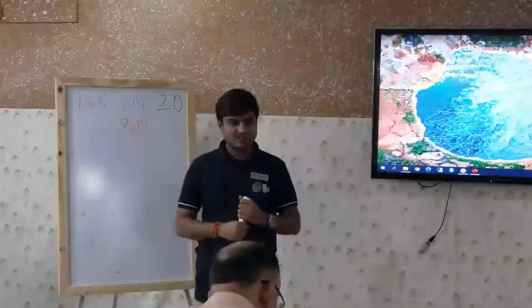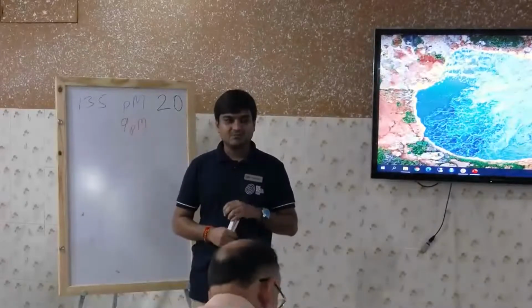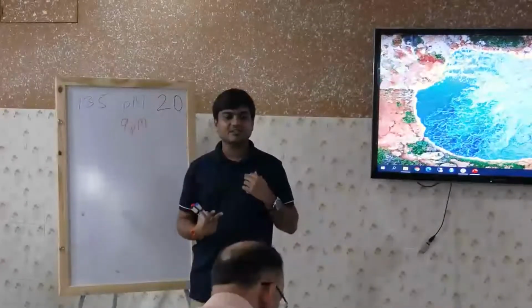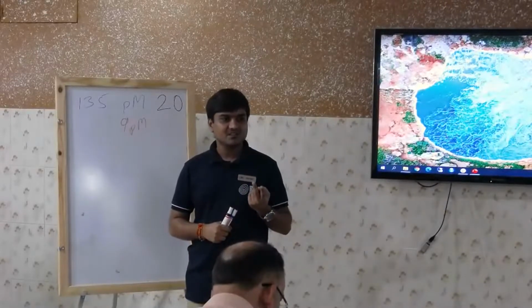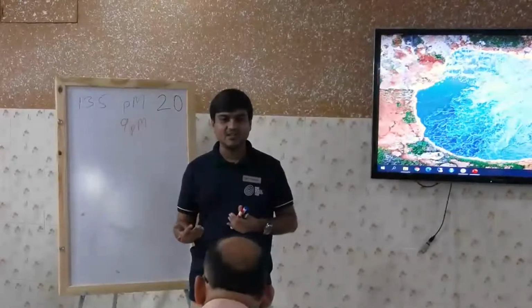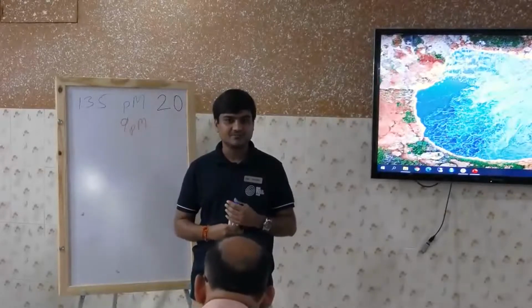So what we do first is calculate the dilution factor. For example, if we had 10 picomolar to dilute up to 5 picomolar, so our dilution factor in that case is 2. That is, we are diluting it 2 times. Similarly, we have 50 and we want to dilute till 5. So we say it as 10 times dilution. So that 10 times, that is your dilution factor.